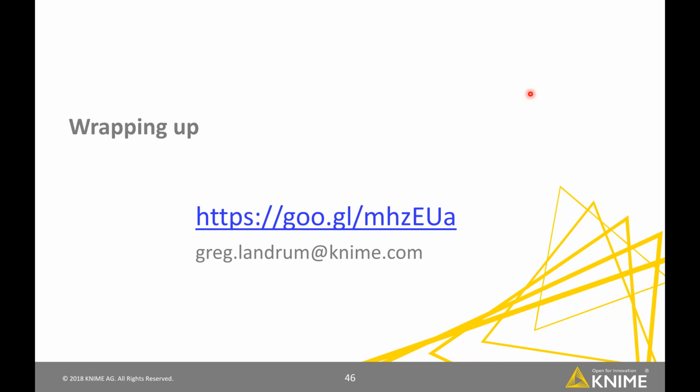So I almost tend to install all of the trusted community nodes. In Knime itself, if you download Knime, there's a box where you can install new nodes, and you identify the trusted community ones. I tend to install all of those because I find myself using them, not constantly, but reasonably frequently.